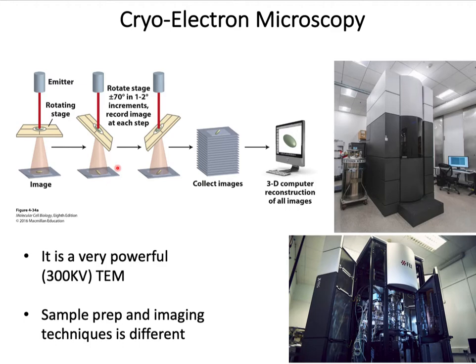This slight difference in each individual image is processed and analyzed with highly sophisticated mathematical algorithms to produce stunning three-dimensional images, even at atomic resolution. Earlier, conventional TEM could be used to reconstruct 3D images, say of a cell, but it is extremely labor intensive.